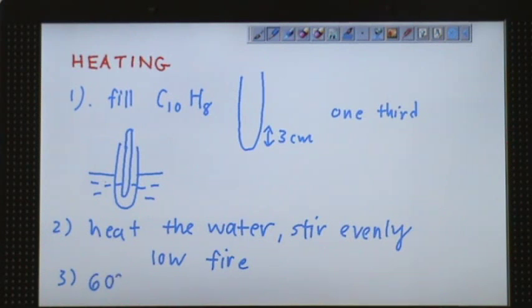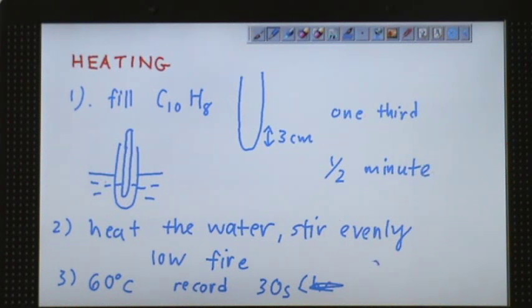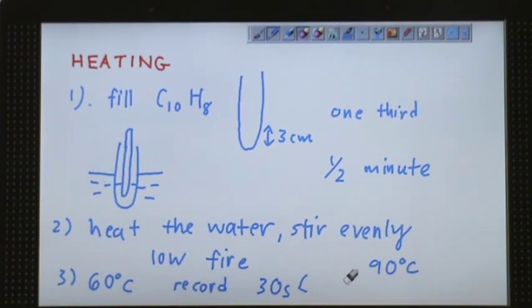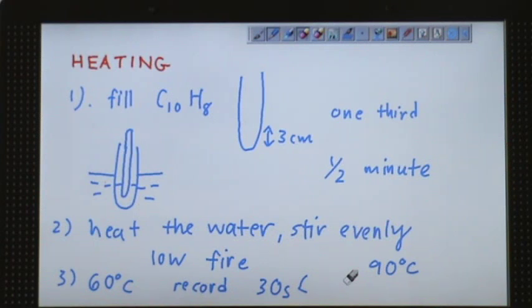When it reaches 60 degrees Celsius, you start to record with your stopwatch. Record the temperature changes every 30 seconds, every half a minute. Record this until it reaches 90 degrees Celsius. Fill up all this information into a table where you begin from time zero and after 30 seconds you record a new temperature. Record this and observe what is the state of the substance, whether it's solid becoming liquid or other states. This is the heating part for naphthalene.